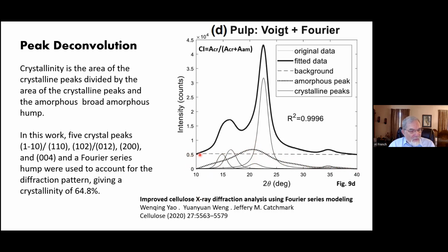Here you see that they've made a 2-point background correction. So they assumed that the intensity was actually 0 at this point and at this point. And so when they fitted the crystalline and amorphous peaks, they added to their value this background value here, which pushed that whole pattern up to where you summarize all these individual intensities to get this fitted line. And they got a very nice fit in this pattern as they did with all the others.